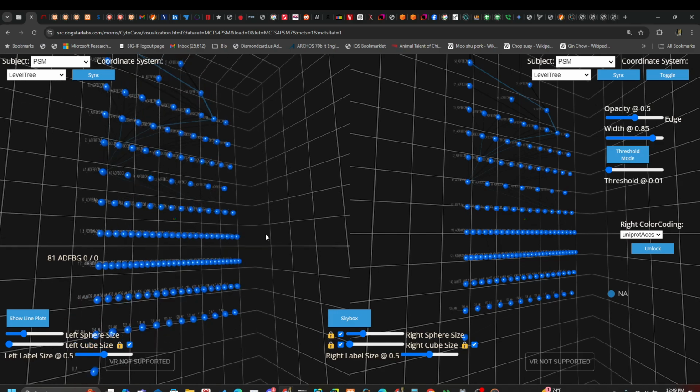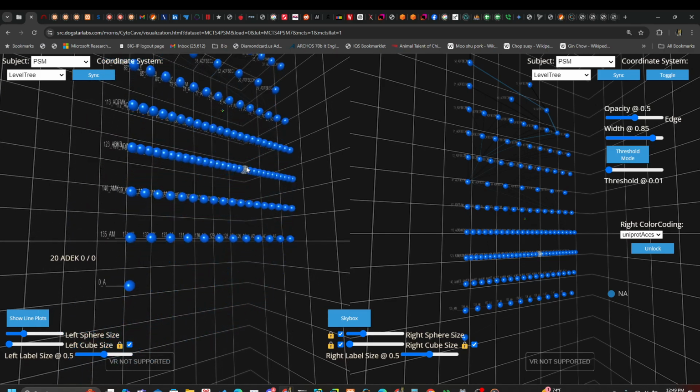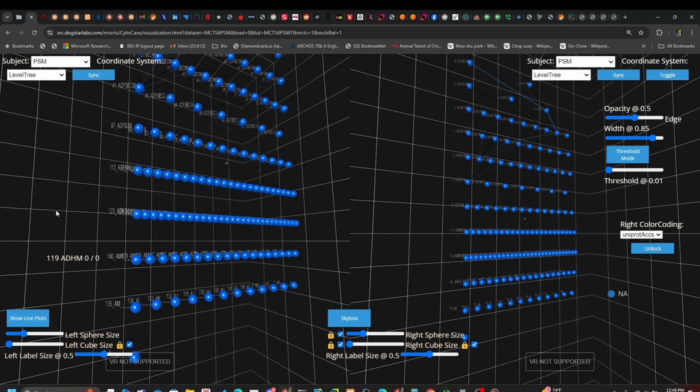This visualization is for a run on a proteasome complex, which contains 13 chains, denoted by the letters A through M. Here we see the MTCS decision tree. Down there it starts with A, and then these are the dimers that it puts together, and then it keeps adding a chain to the growing complex.